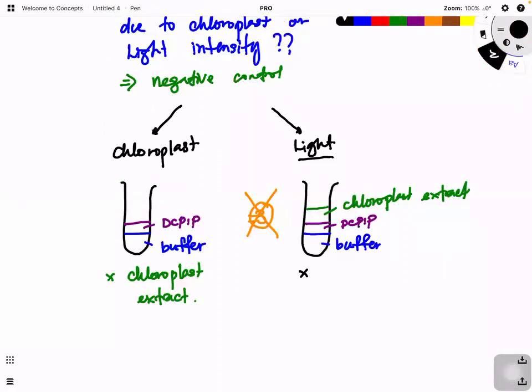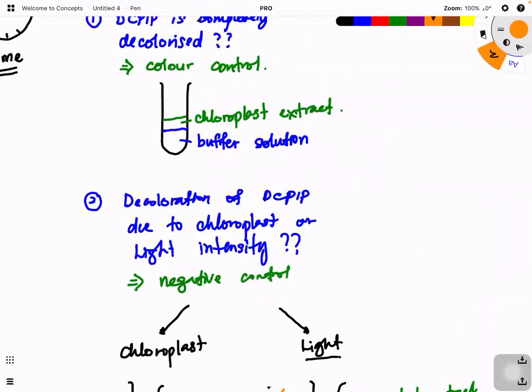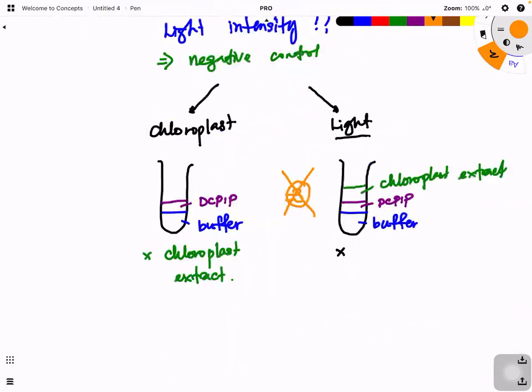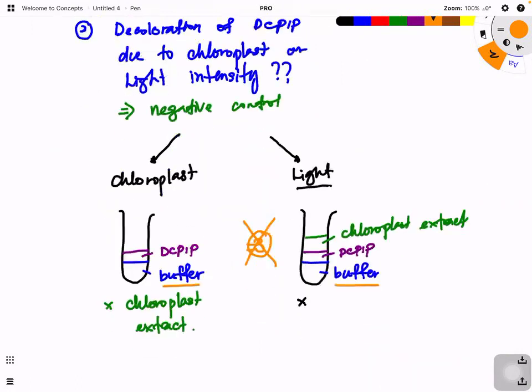But now we do have a little bit of a problem here because of the concentration. Are you clear? Try to imagine that the buffer solution here will act something like a solvent. If you have the same amount of buffer solution but two different items here, the concentration will vary. So you must dissolve everything using the buffer solution to make sure that the concentration remains constant.